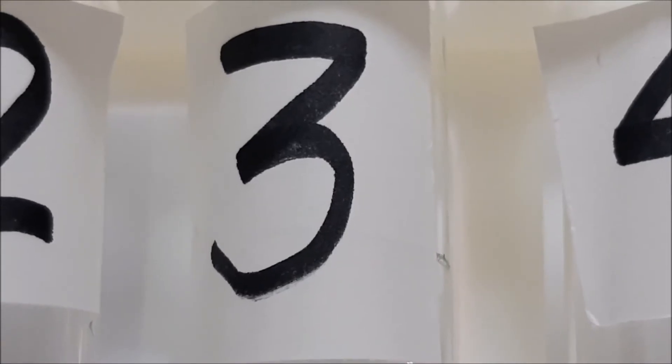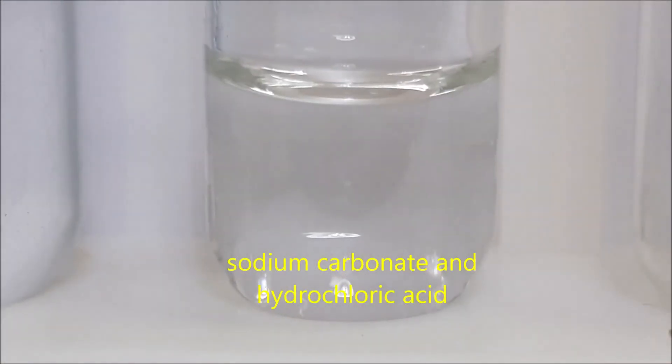For test tube number three, we have sodium carbonate and hydrochloric acid.